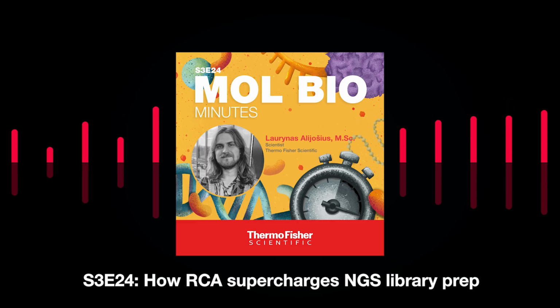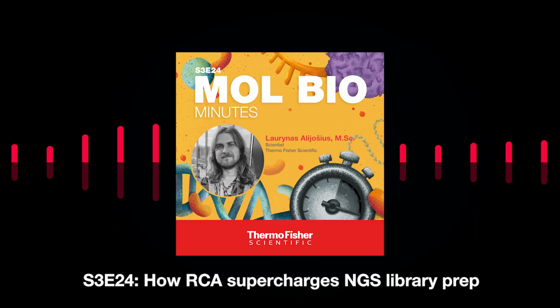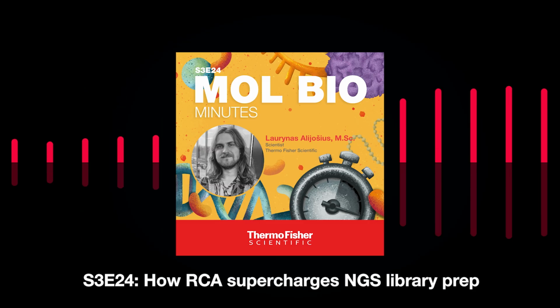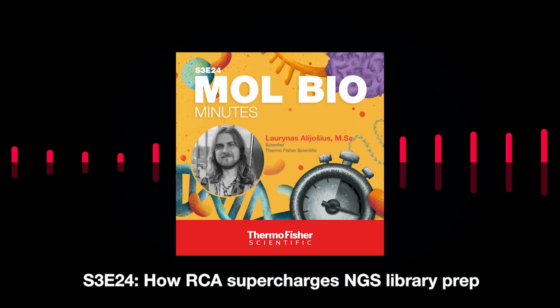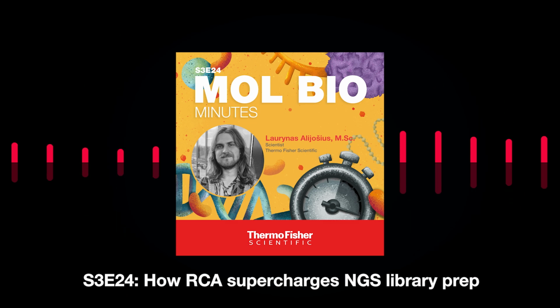So we talked about unique RCA features, but why can it be beneficial to pair it with next generation sequencing applications? Well, sometimes the amount of your DNA material can be too low to prepare a good quality NGS library. This is where highly sensitive and high yielding RCA or whole genome amplification can come to the rescue.